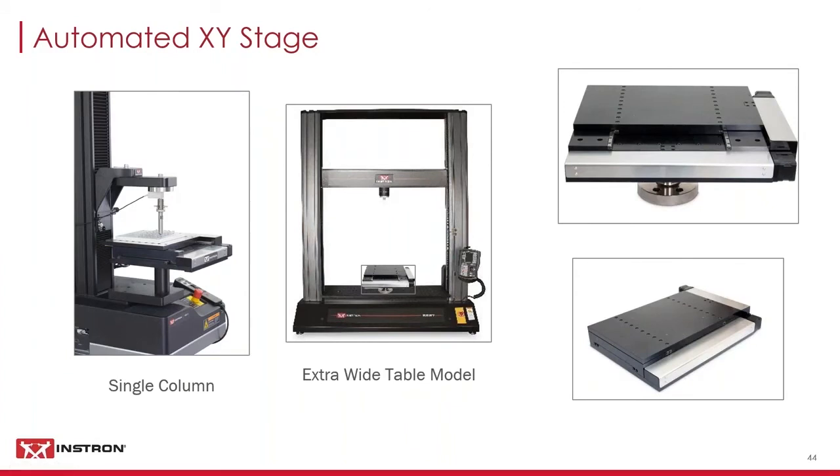In a moment, we'll discuss applications that can be run on an XY system. As we do, keep in mind the tests you run in your own lab. Many tension, compression, and bend tests that you run on a manual system can be set up on an XY system as long as the proper fixturing is used. I'm going to play a video that shows some tests being completed with an XY stage.